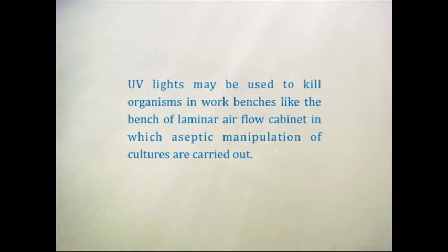The next technique is irradiation. UV lights may be used to kill organisms in workbenches like the bench of laminar airflow cabinet, in which aseptic manipulation of cultures are carried out. However, it should not be turned on while any other work is in progress, since UV light of some wavelengths can damage eyes and skin.